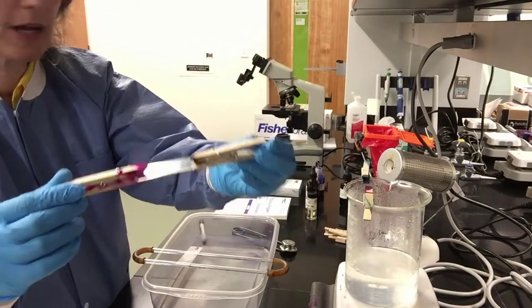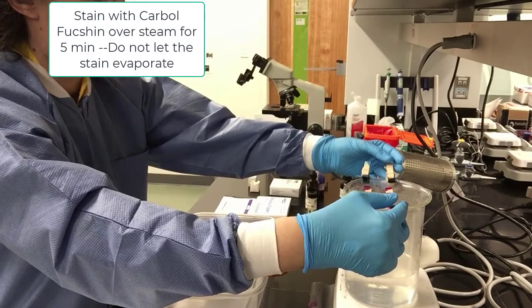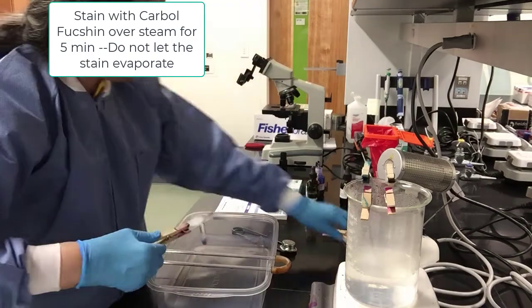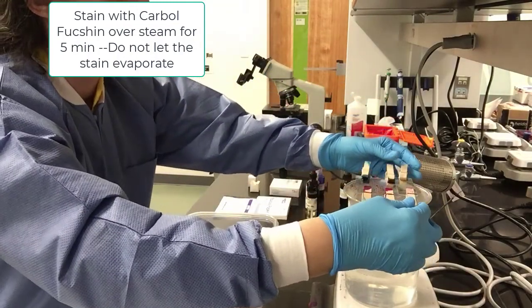We clip the next slide, both ends, and we place it on the beaker, making sure we balance them. If they're not balanced, they'll fall into the water, and then the hot water will kill your specimen and will wash it off pretty much.